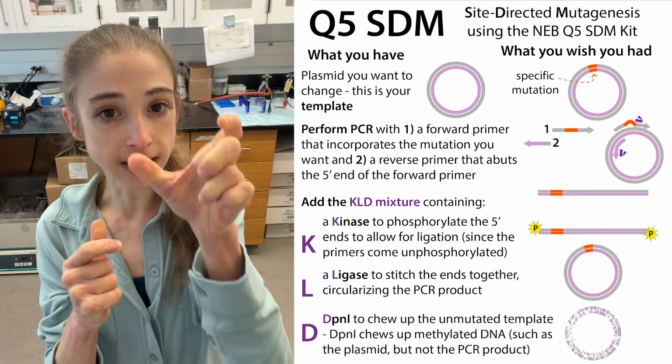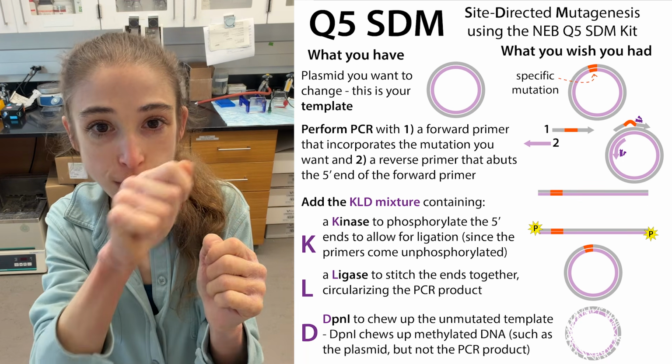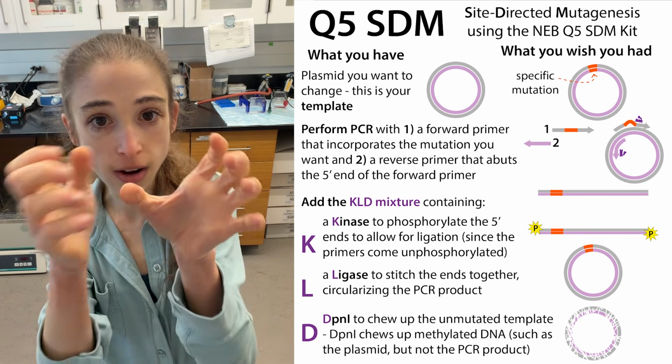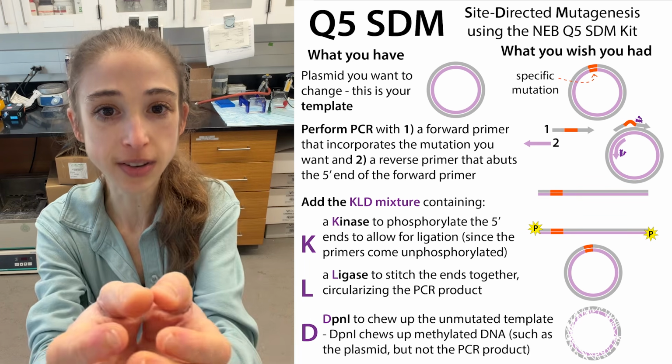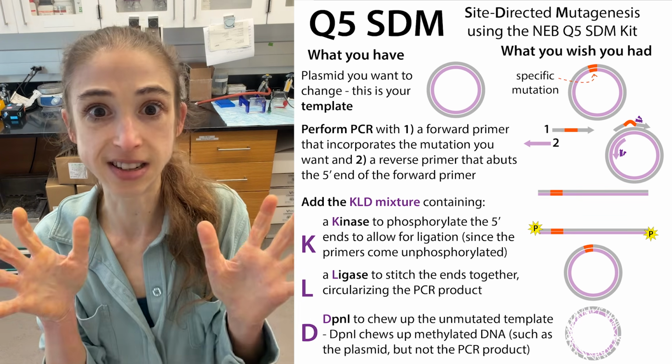And so you take the first page and you make a mutant version of it. You change the wording in that version, and then you copy the rest of the pages, and they're all together. So you make lots and lots of copies of this chapter, and you give it to your nemesis, and then they make lots and lots of these really nasty cookies.